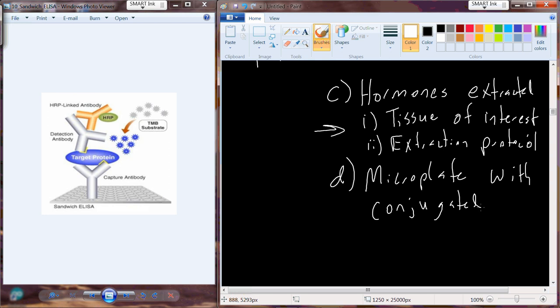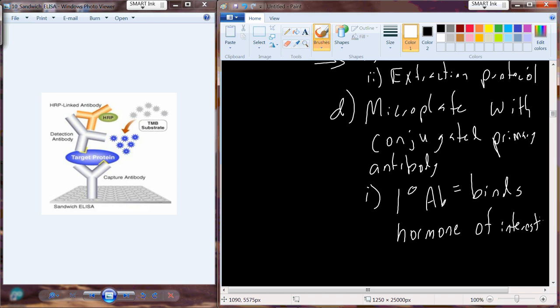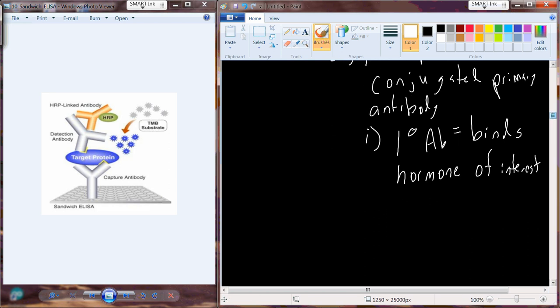The microplate is going to be conjugated with what's known as the capture or the primary antibody. In the world of cell biology, that's typically abbreviated as what looks like 1 degree. That just means primary. So it's going to be this primary antibody that's programmed to bind your molecule or your hormone of interest. A lot of times these antibodies are going to be produced in a specific organism, like maybe a donkey or a rabbit, and then we extract them out. And so they'll be programmed in the donkey to respond to testosterone, to respond to insulin, to respond to glucagon.